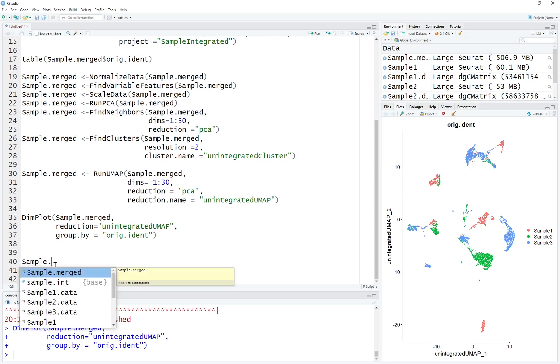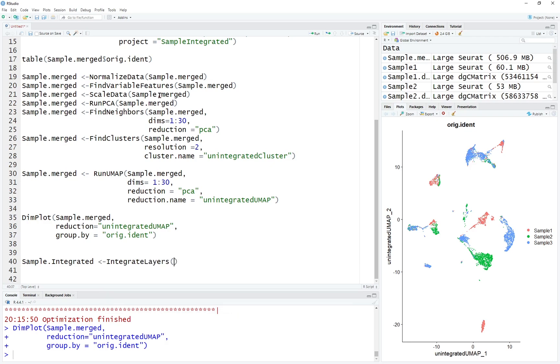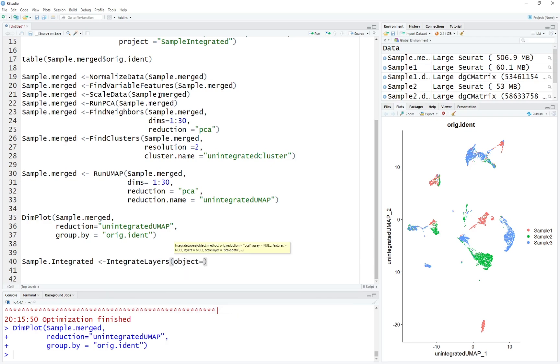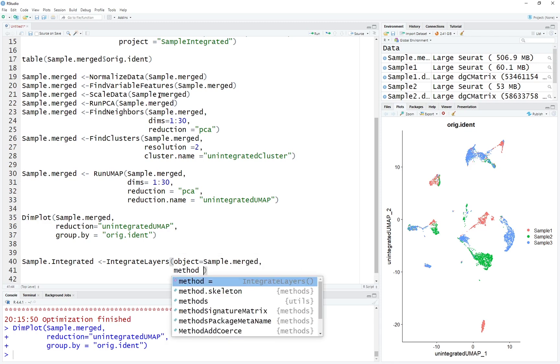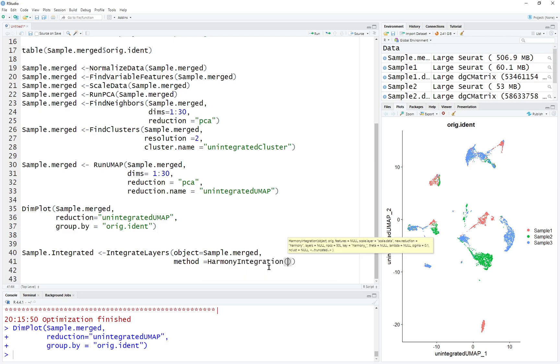We're going to call the sample integrated — let's rename it as integrated. It's called IntegrateLayers — just one line of code. The object equals sample merged, and the method we're going to first use is called HarmonyIntegration. Harmony is the method I would recommend because it's very fast — for most computers you'd be able to do this. Other methods will need a much higher-end computer because they're computationally inefficient. The method is HarmonyIntegration.